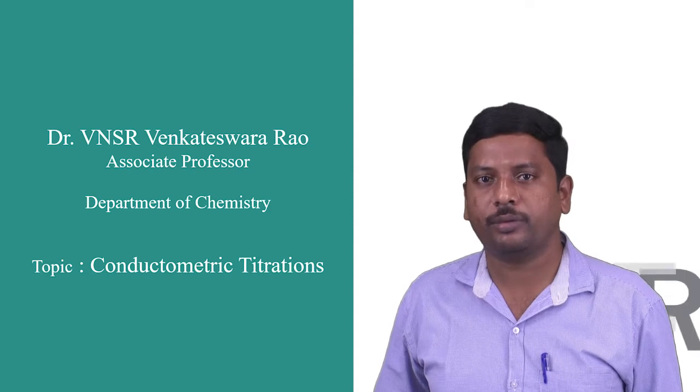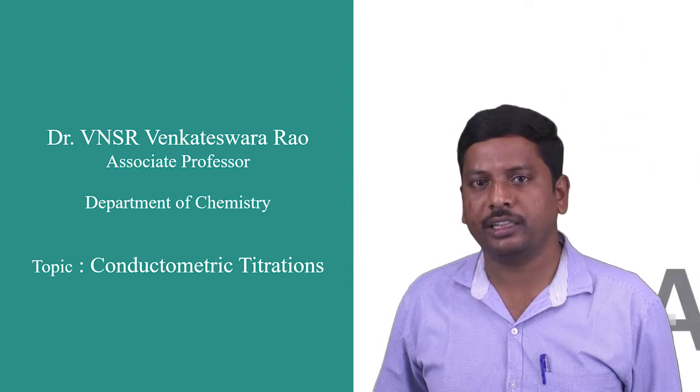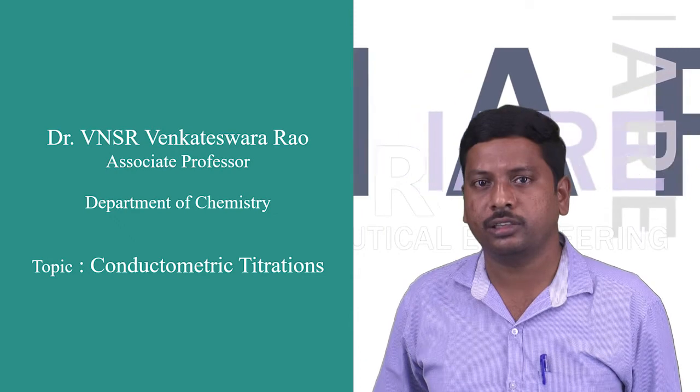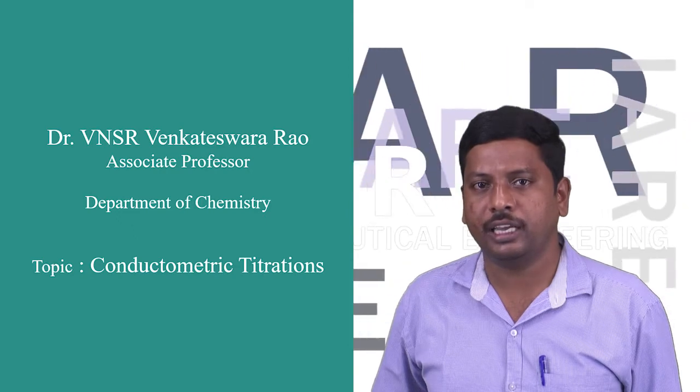Today I would like to give the topic on conductometric titration. Conductometric titration is one of the instrumentation titrations to determine the endpoint of various reactions like neutralization reactions and precipitation reactions. Almost all conductometric reactions give more accurate results compared to the classical methods of analysis.